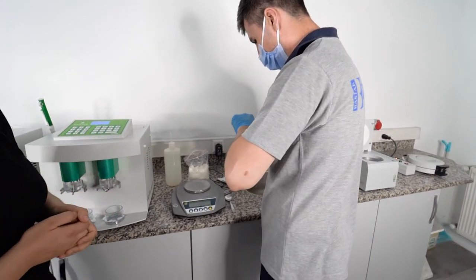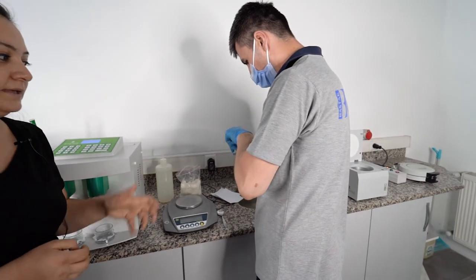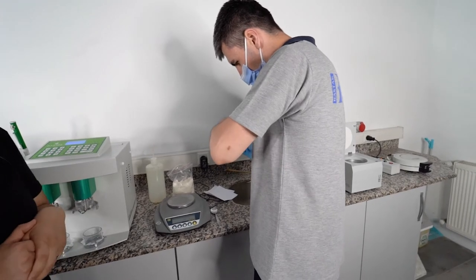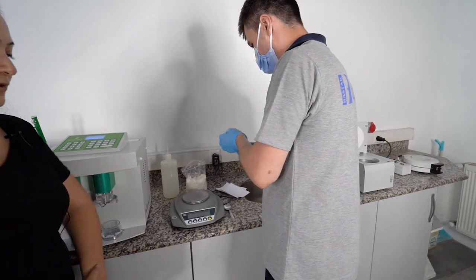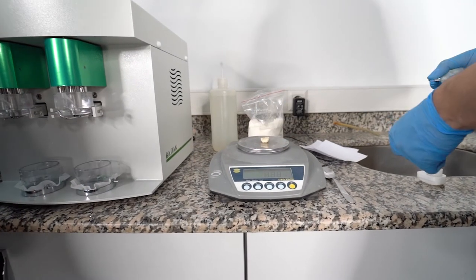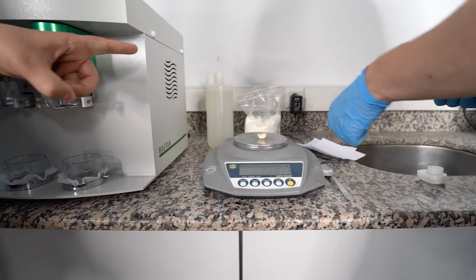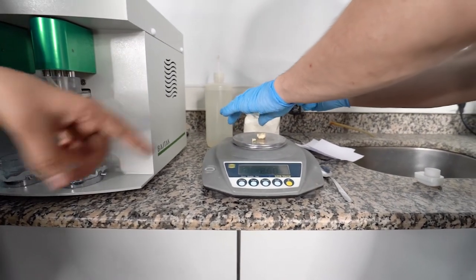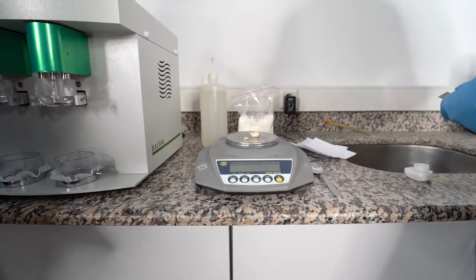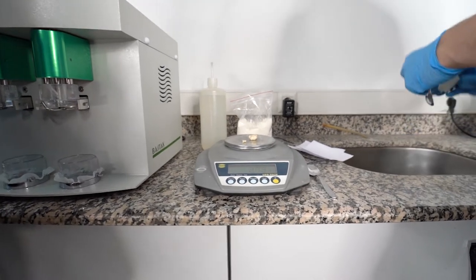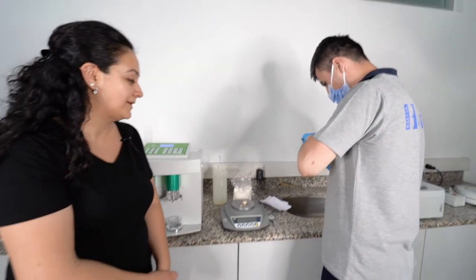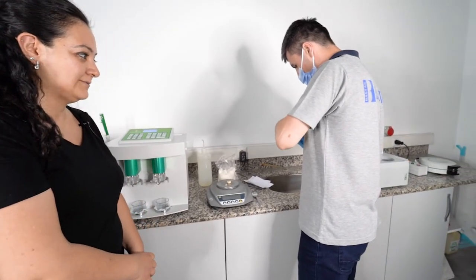The calculation of the gluten index is strong gluten divided by total gluten and multiplied by 100 in order to calculate percentage. This is the strong amount: 2.58. And now we are adding the weak amount: 2.73 is the total amount. We are calculating the strong value, dividing by the total amount, and multiplying by 100.